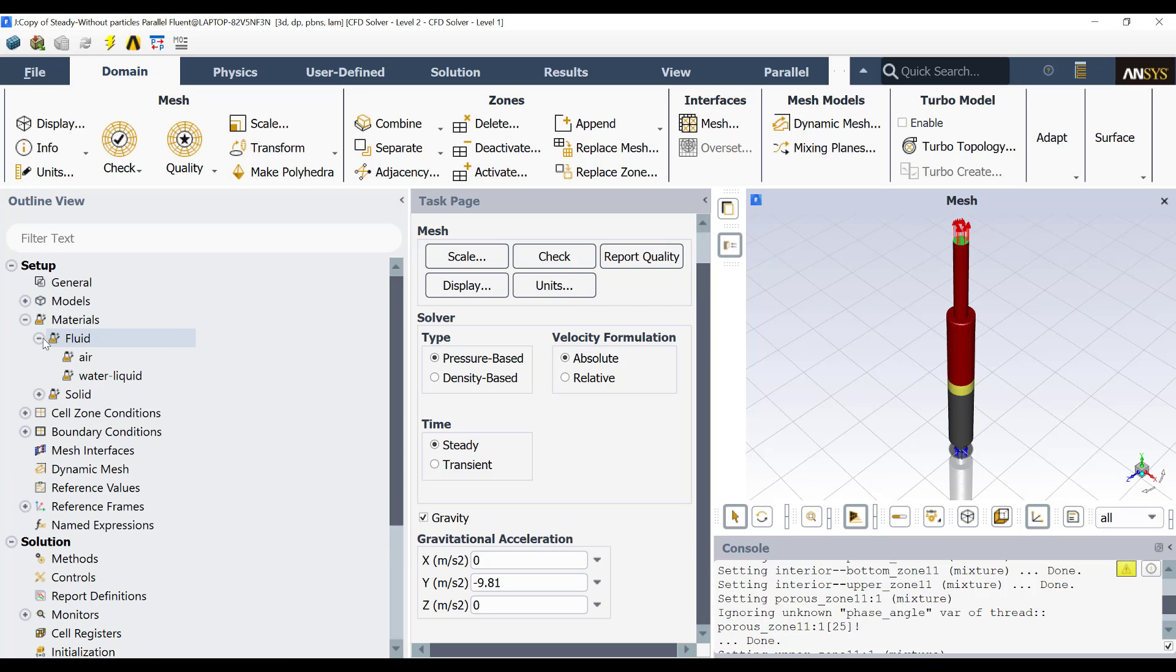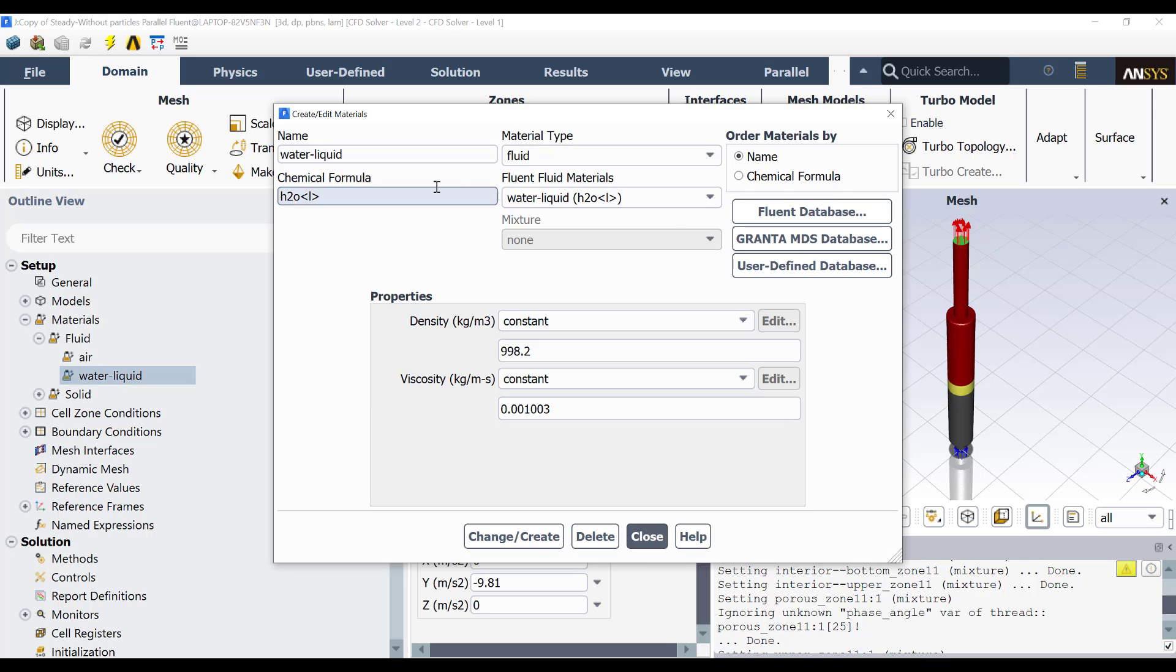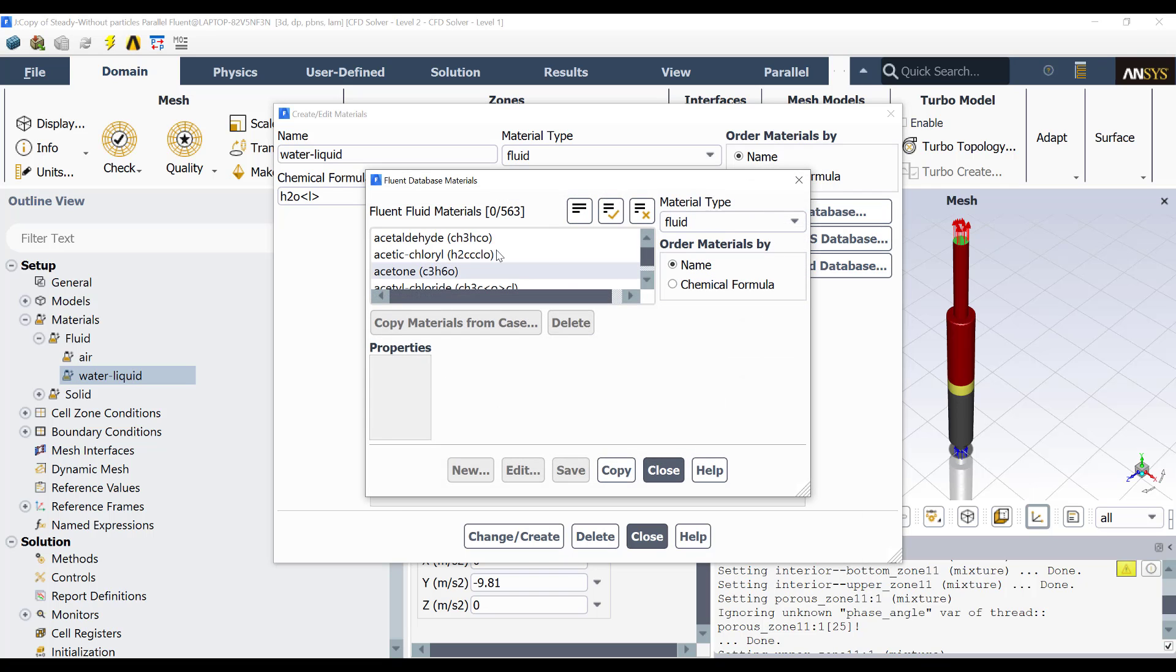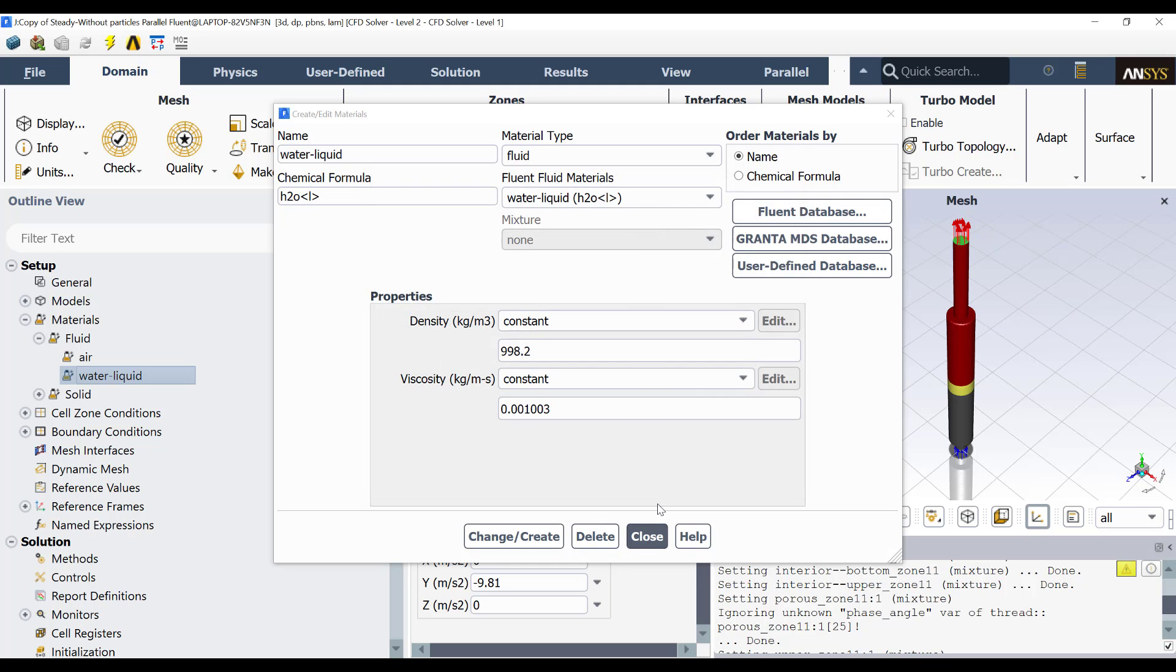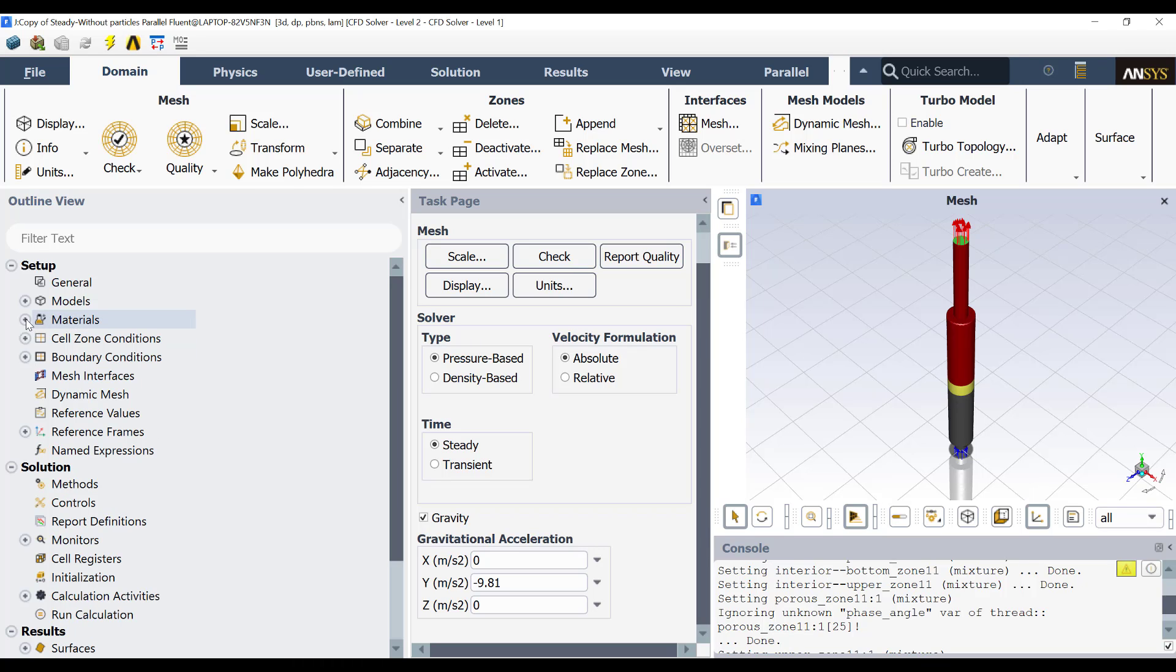If I go here, then you see that I have water liquid as a material. Remember, if you want to include another material here, then you double click one of these, then you go here to Fluent Database. Then you select the fluid you want, copy and close, and you will have the other fluid here if you want to select it.